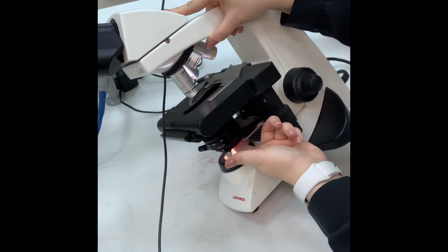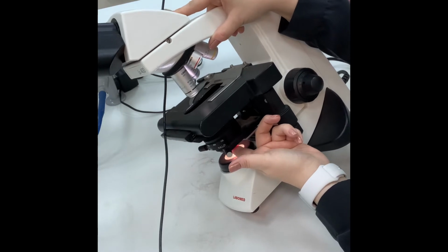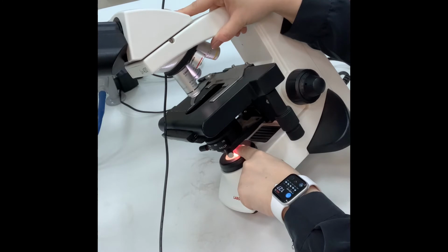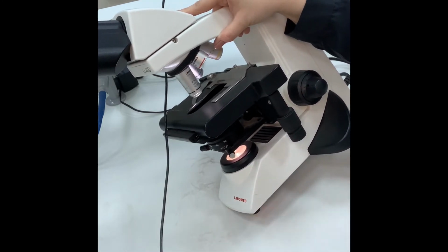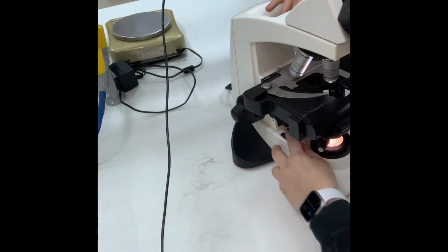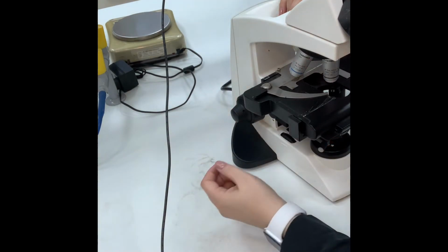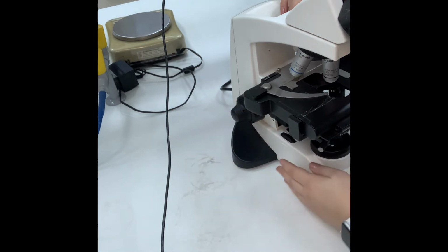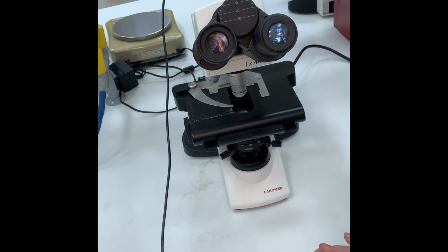Now, this lens over here, which I cannot remove, is called the iris diaphragm. This is the light source. This is the base of the microscope. And I have two knobs. Those knobs are for the light, basically. This is the light intensity. And in the back, I have the light switch. Now, sometimes you find both of them in the back, both of them on the base. This depends on the manufacturer itself.